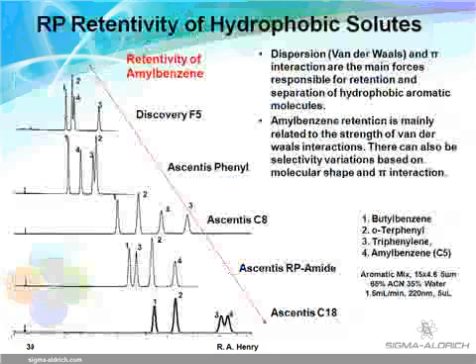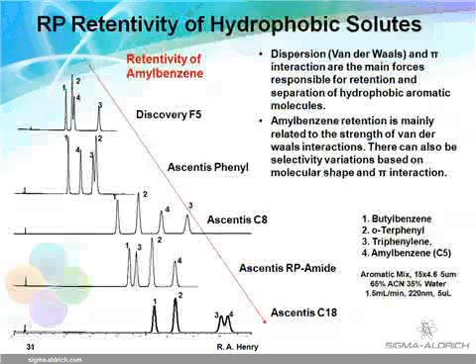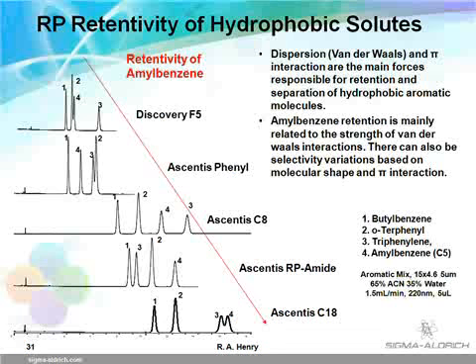Solutes that are very hydrophobic and contain mostly carbon typically show maximum retention and selectivity on C18 and C8 columns, as seen for some simple aromatic molecules. Note that aromatic character alone does not make the two aromatic phases more retentive, so the rule of like attracts like does not apply. It is more often differences in chemical structure that create molecular interaction, retention, and separation.